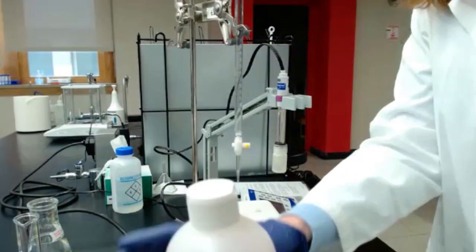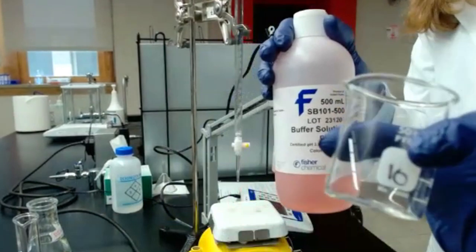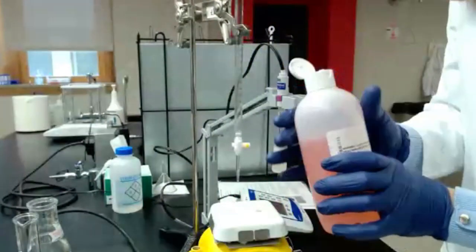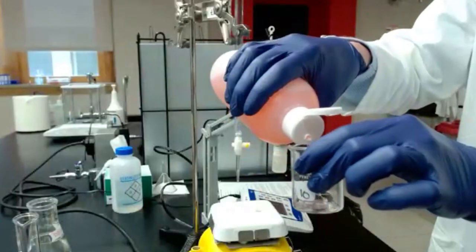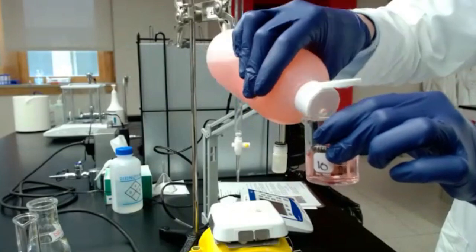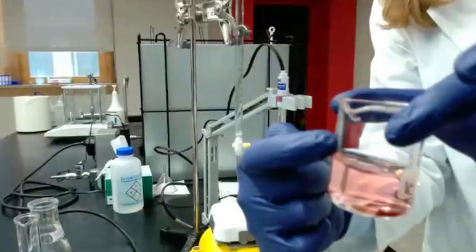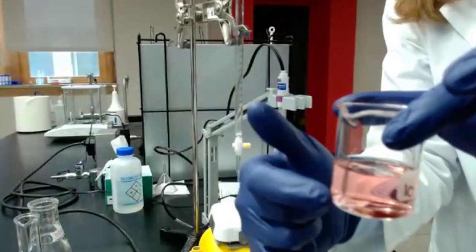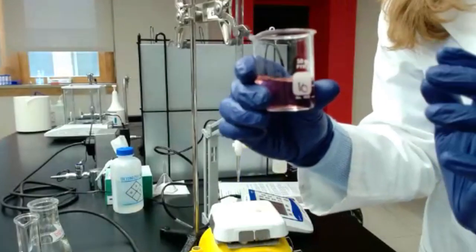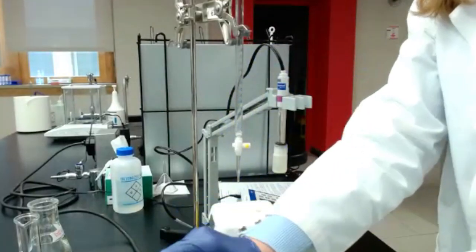If you have those buffers, make sure you transfer them into a smaller beaker or a tube. Make sure you pour enough in your beaker or tube to cover the entire probe. The electrode should be in contact with the solution, so make sure you have enough volume. That's probably 30 milliliters that you may need in those beakers.